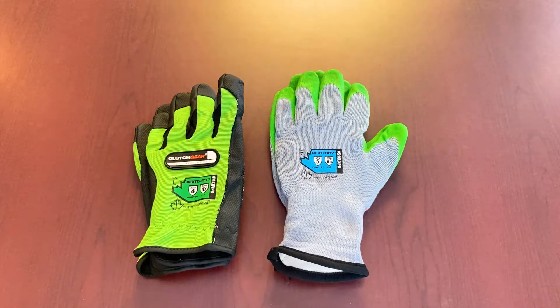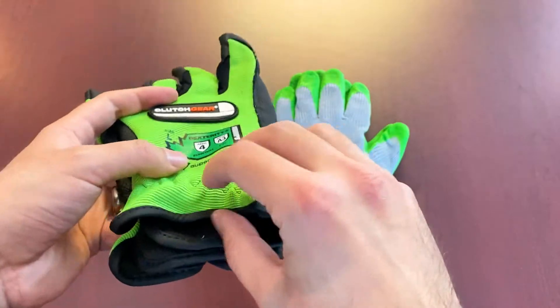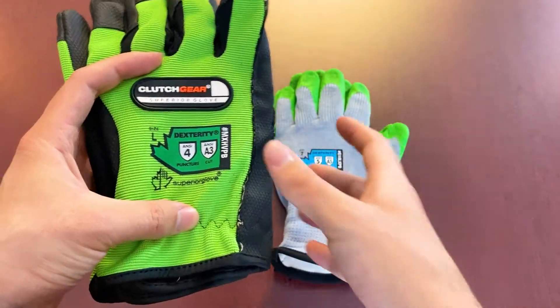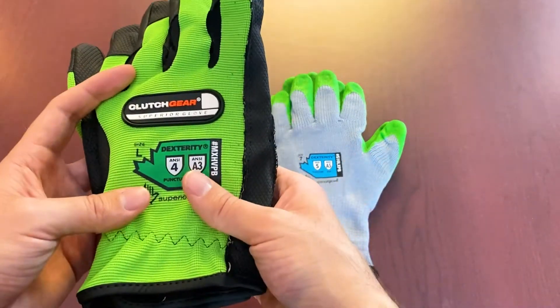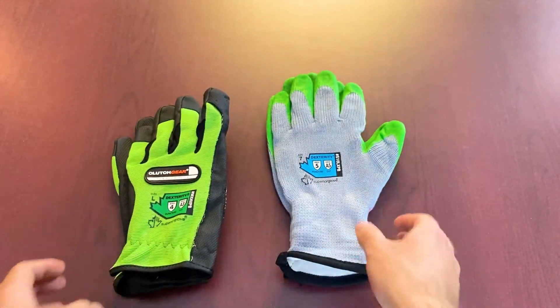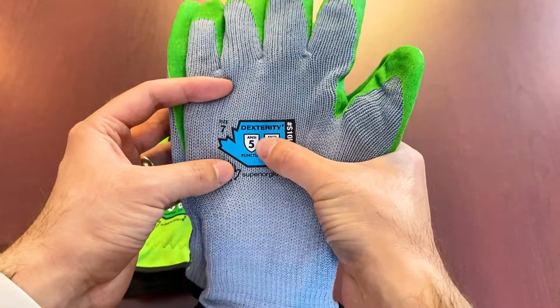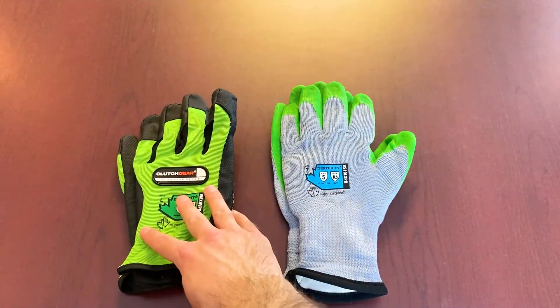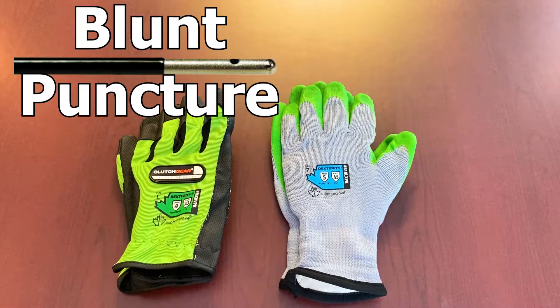Both of these gloves have their puncture resistance stamped on the back, which is ideal — that's the best location. Fetching inside for a tag works, but it's always nice to see your puncture protection ratings right on the back of the glove. This one has ANSI puncture level 4, and the other has ANSI puncture level 5.